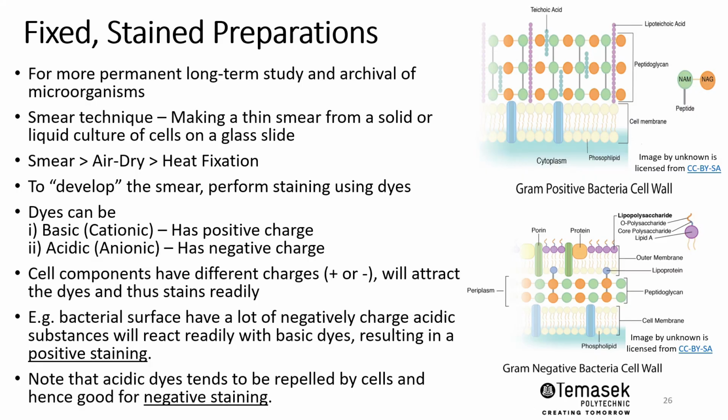If we look at fix and stain preparation, this is different from fresh and unstained or unfixed preparation. We want to fix the microorganisms so that we can do more long-term study and also archival of these microorganism specimens. So typically we will do a smear technique. This involves making a thin smear from a solid or liquid culture of the cells on a glass slide.